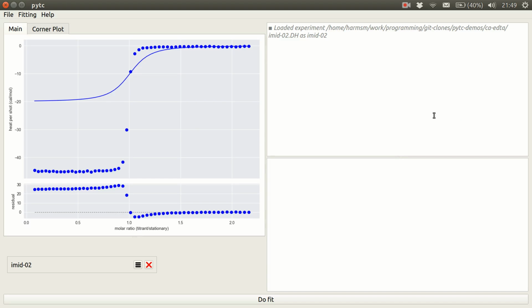So one of the things that always comes up in any kind of model fitting is overfitting. That is, are you trying to fit more parameters than can be justified by the data? One really nice way to decide if you're overfitting is using something called an AIC, an Akaike information criterion, which basically penalizes fits that get better because they add more parameters that fit stochastic variation in the data rather than a real signal. And so that's implemented in pytc, and I'm going to show you how to do that.